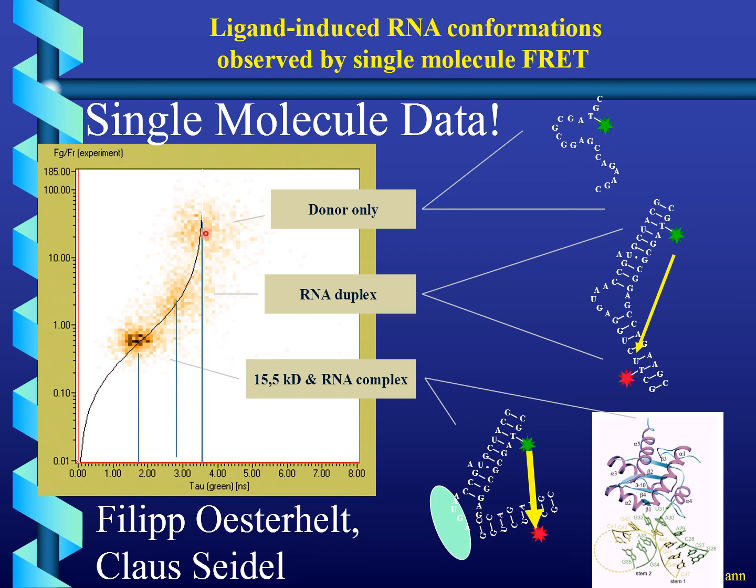And in this particular case, it's interesting because it's single molecule experiments. You can identify 3 clusters in these sort of double 2D histogram, and these are different forms of the molecules that can exist. So there's basically an open form, which is the donor only, where the molecule is not bound to its acceptor. So these are RNA molecules. Here you have the doublets being formed, but it's not yet conformationally adjusted to a final position.